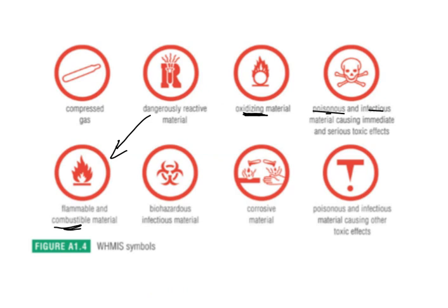Corrosive, here's a symbol for corrosive. Basically, it means that it could eat away and dissolve and corrode your skin. You got to be careful on those.